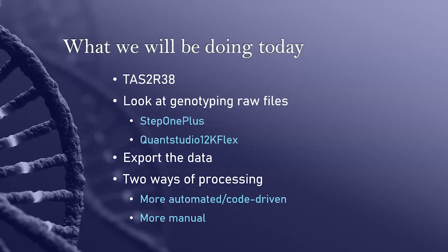If you have problems running the code or it just doesn't make sense to you, you can always use a manual or Excel-forward method of analysis. I personally think that it is more irritating than R, and that's actually pretty difficult to do, to be more irritating than R. So I definitely would recommend at least trying the R code and seeing if it works for you.